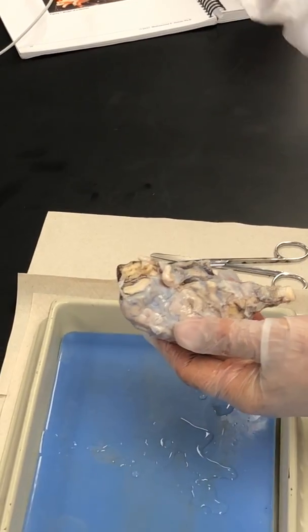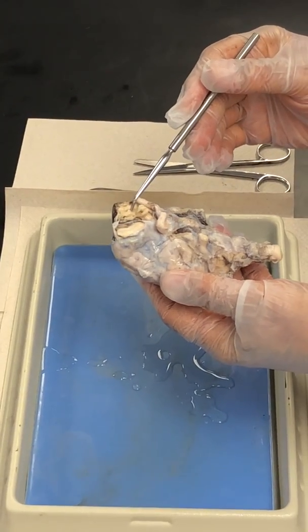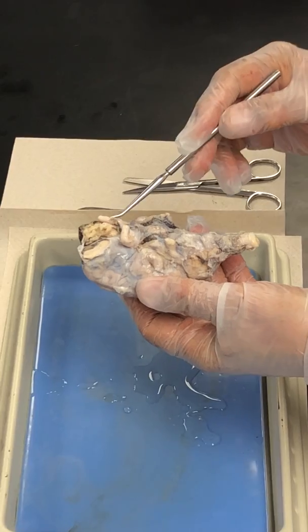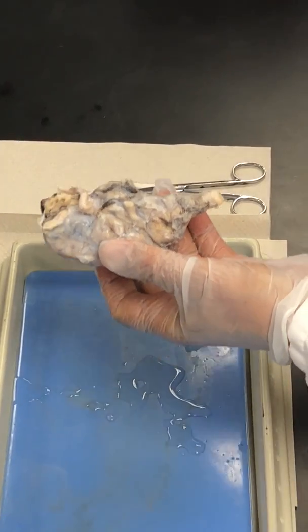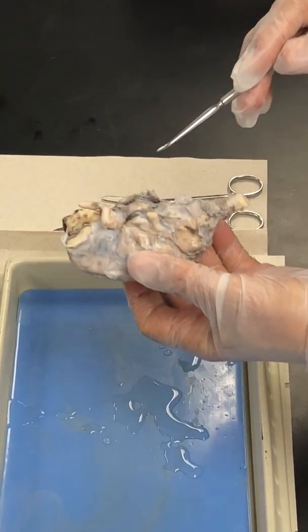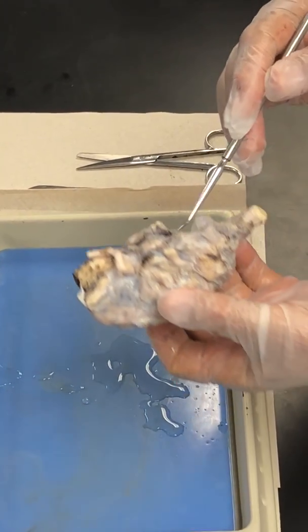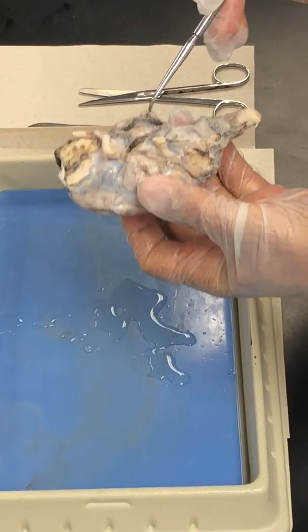Now the nerves that I mentioned, olfactory nerves, that's one of them there, and that's the other one on this side in here. The optic nerves are these. That's one of them, and that is the other one. The other thing in this brain that's also important, you're not going to see it when I remove the dura mater, is the pituitary gland. This is actually the pituitary gland right there. This thing right here.